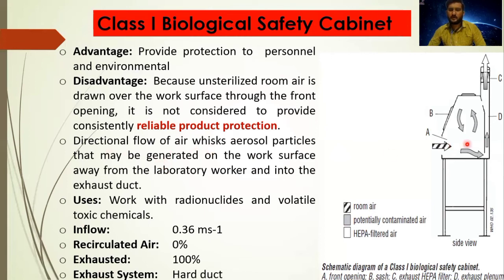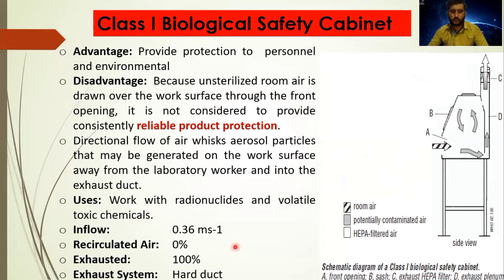The air flow within the class 1 cabinet means that aerosol particles and small droplets generated on the product move with the air into the plenum. From the plenum, after filtering through the HEPA filter installed in the exhaust, fresh decontaminated air enters the environment. So the aerosol particles are not harmful to the environment and user. Class 1 biological safety cabinet can be used for radionuclides and volatile toxic chemicals. The recirculated air is 0% — once air passes through the cabinet, it does not return; 100% of the air is exhausted.